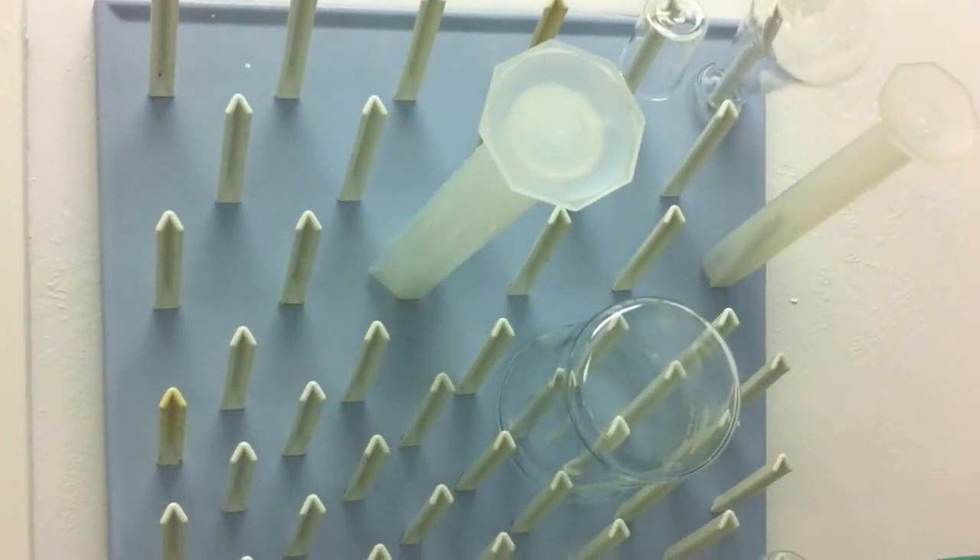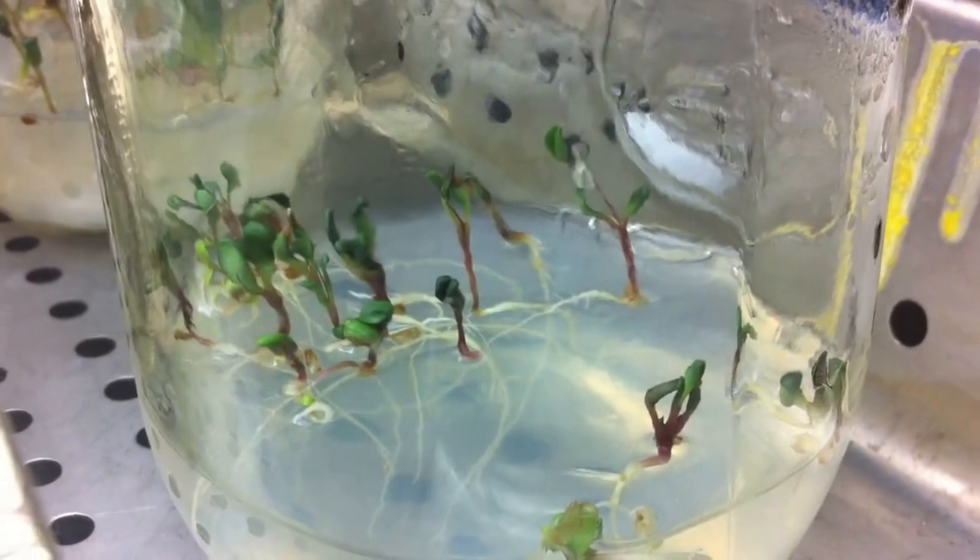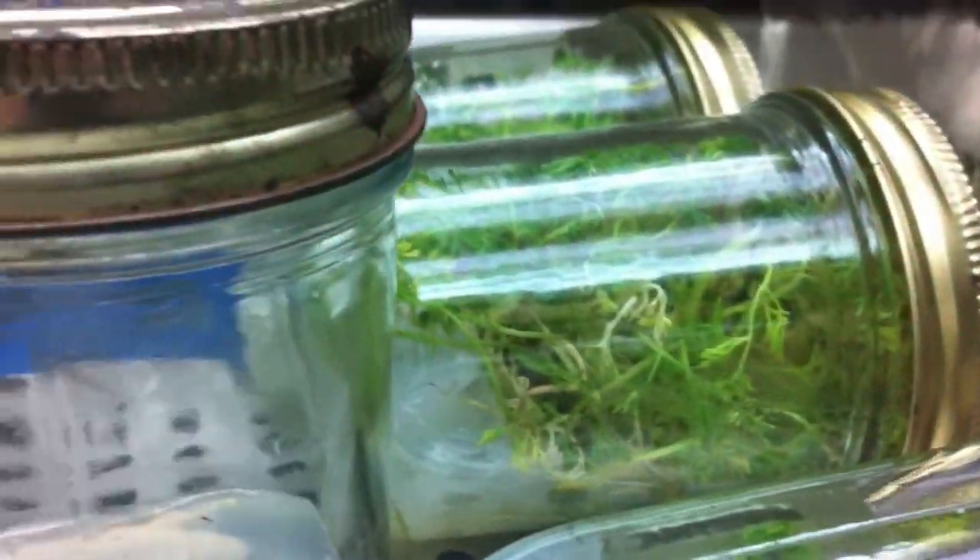In the lab, there's a lab sink, negative 20 degrees Celsius freezer, a fridge, PCR machines, QPCR, balance, autoclave, micropipettes, single and multi-channel fluorescent microscopes, microcentrifuges, protein purification system, and common lab supplies such as test tubes, pipette tips, glassware, and sterile single-use test tubes.